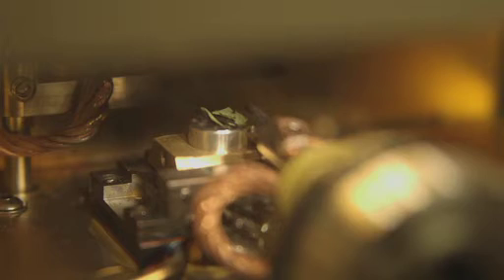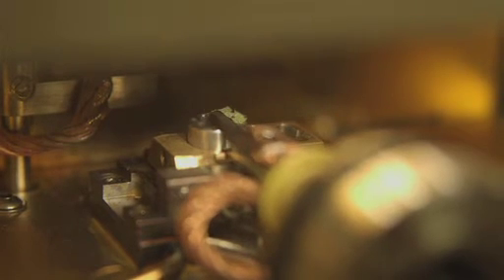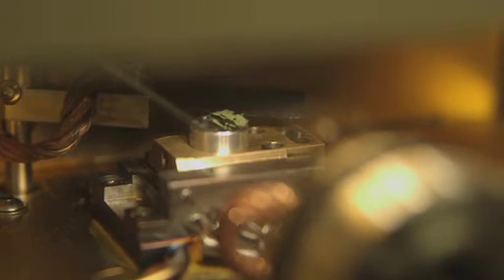Two actively cooled fracturing knives can be used to break open specimens and reveal hidden structures and detail.